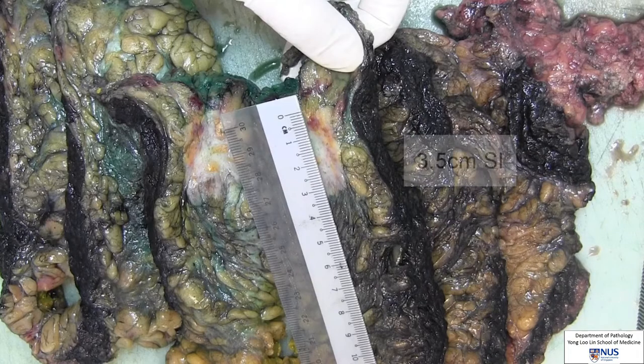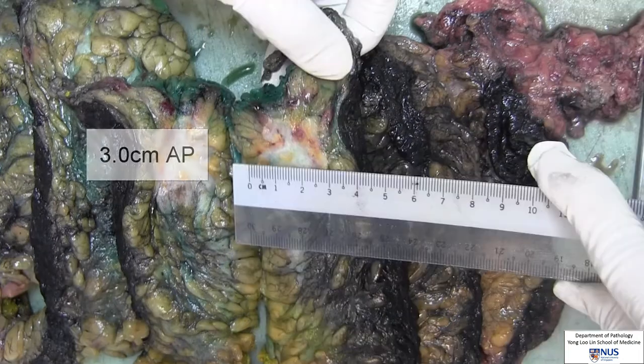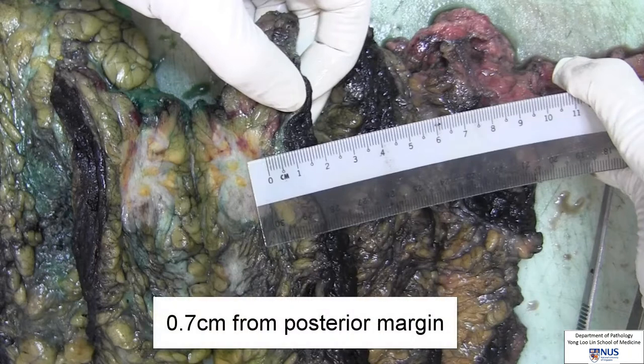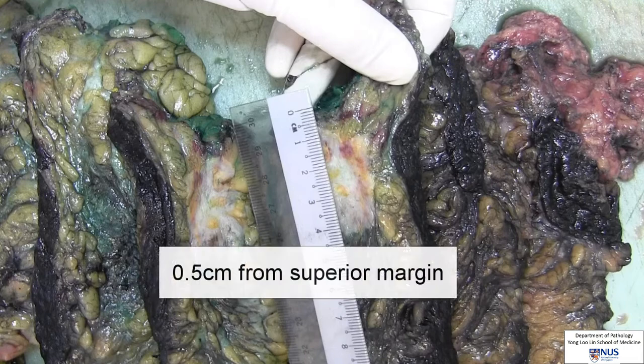The tumor measures 3.5 centimeters from superior to inferior, 3 centimeters from anterior to posterior, and 2.5 centimeters from medial to lateral. The tumor also measures 0.7 centimeters from the posterior margin and 0.5 centimeters from the superior margin.